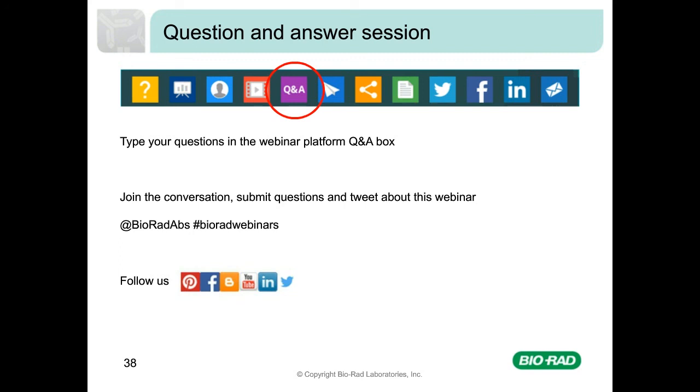Okay, a question from Yang. When we order the antibody for PK analysis, will the information regarding the type of antibody, KD, and recognition site be available? Yes, that will all be available and is already available on our website. So we publish all the assay data as well as affinities and the format of the antibody for all the ones that were shown in the table.